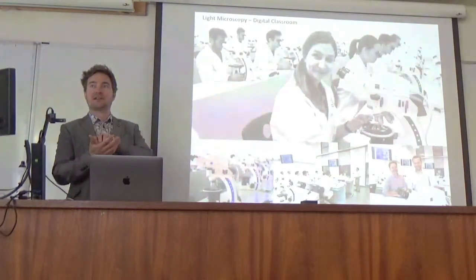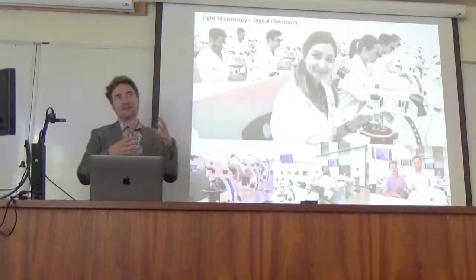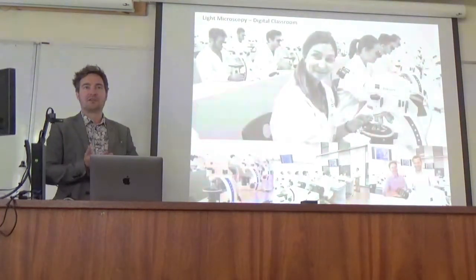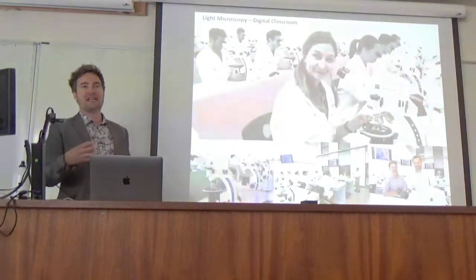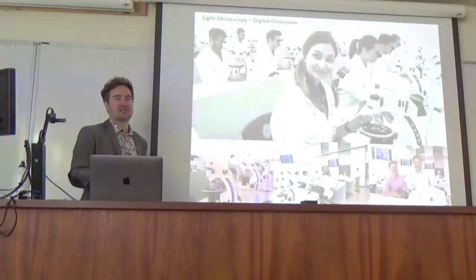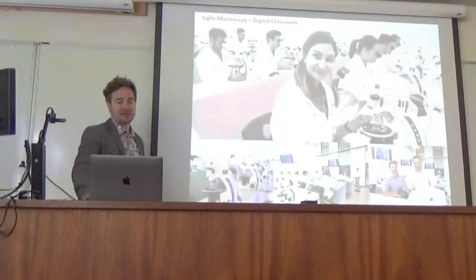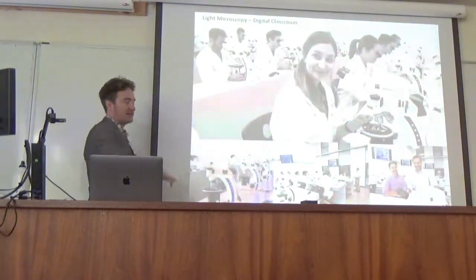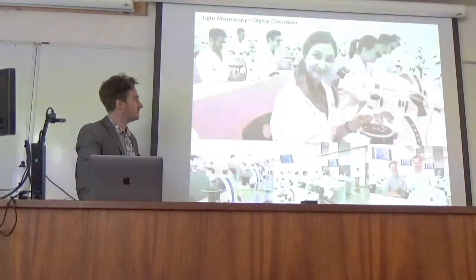So it's great to be connected, but then we have challenges of data flow and data storage and what people do with that. You know, by creating the ease of this, people will just save more and more without thinking potentially about the quality of that. So that's one of the messages we're trying to get across to users. And we bring industry in and they work on these microscopes as well.